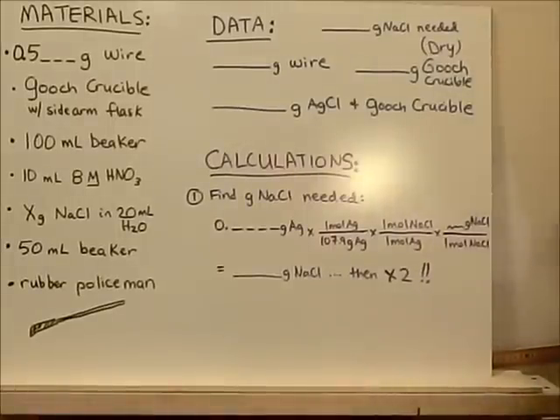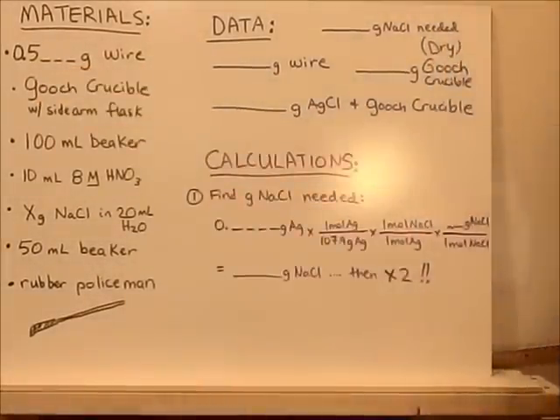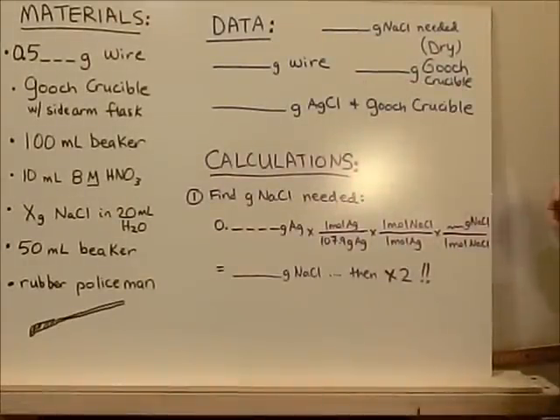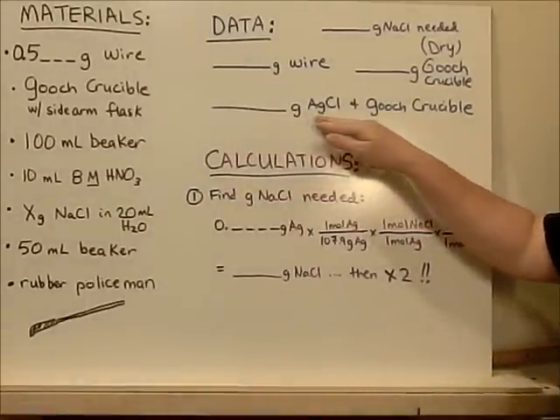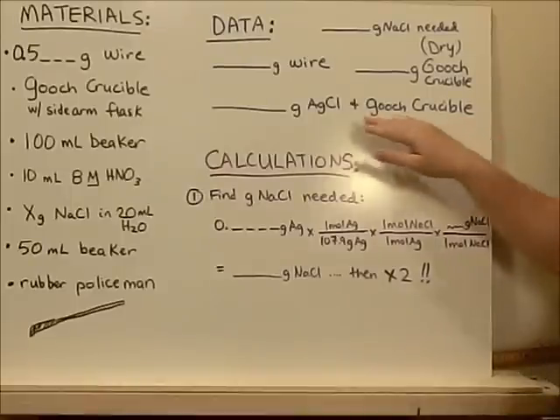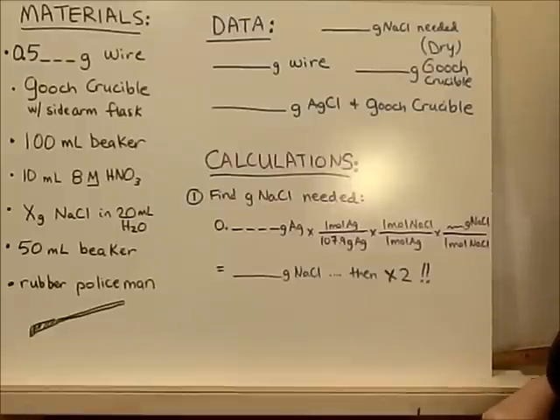All right, here's the data that you're going to collect. First, you're going to mass out the wire, again, to the right number of places. You're going to mass out your dry Gooch crucible. You're going to calculate how much sodium chloride you need and weigh that out and record that as well. Then when all is said and done, and you've dried it overnight, you're going to need the weight of just the silver chloride plus the Gooch crucible, and then subtract this from that, and you'll get the weight of AgCl.